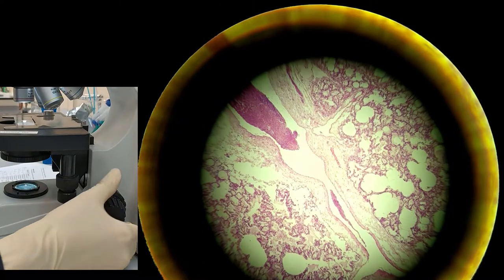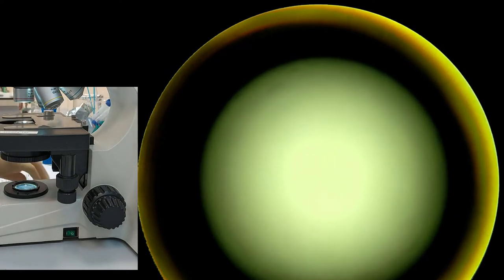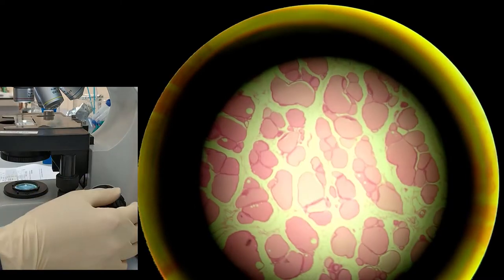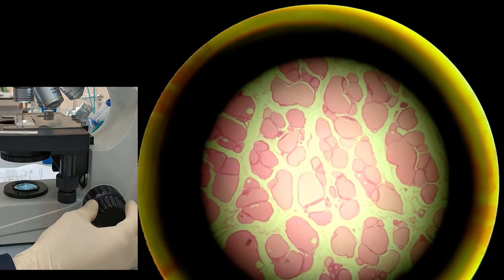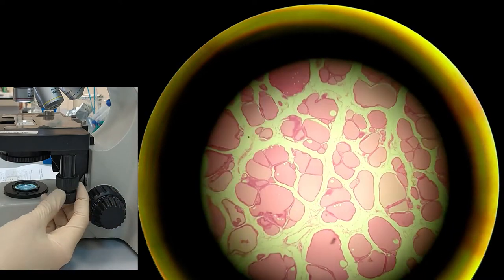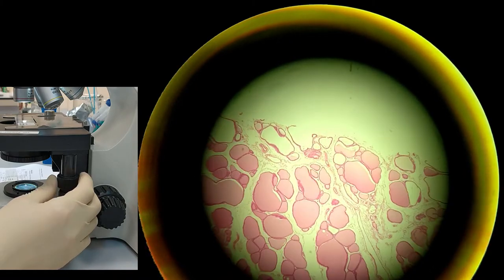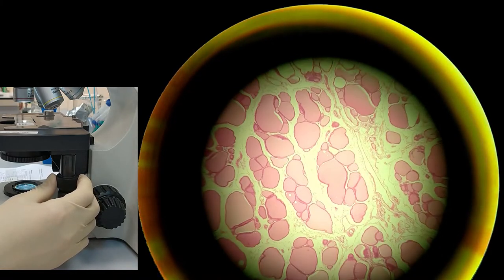So again we switch to the 4x and we can change the slide to the next one. Next we have simple cuboidal epithelium. Now we can see everything that is needed for drawing and it is almost in focus.